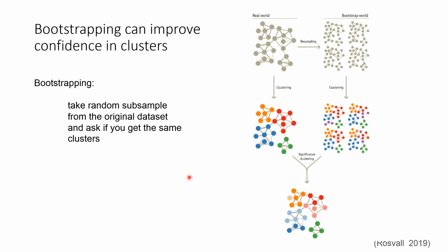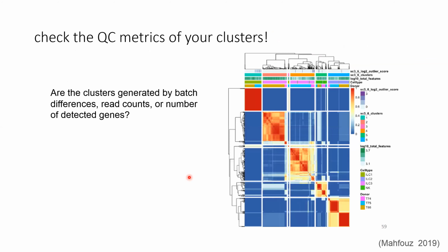For example, if you want to measure how the composition of cell types in your tissue changes after a drug, you can randomly subsample a subset of your cells, say 10 different times, and each time you recluster the cells, annotate the cell types again, and calculate the proportion of each cell type in your data. And then you can generate a confidence interval around the mean fraction to demonstrate that your findings are statistically robust.